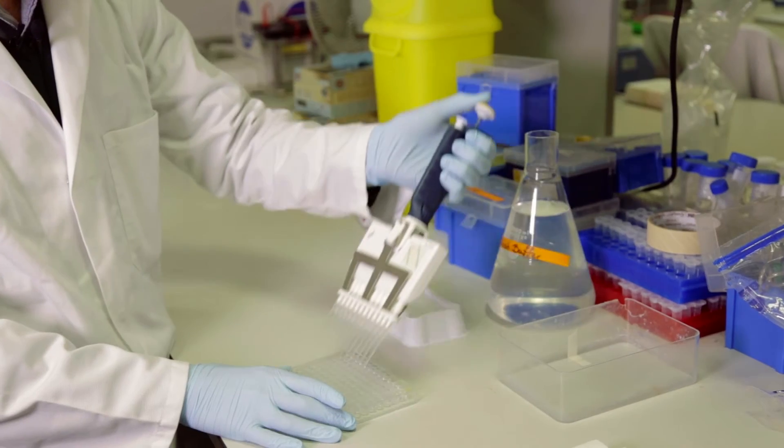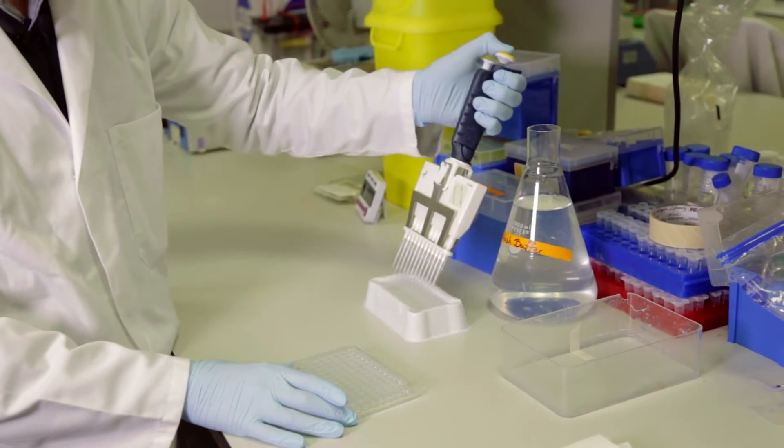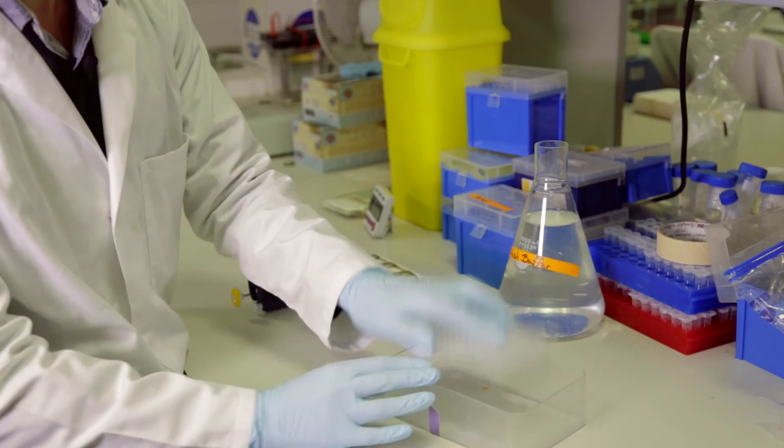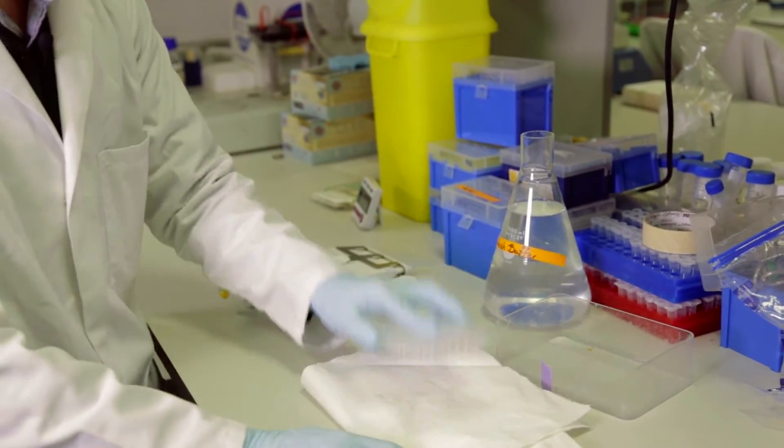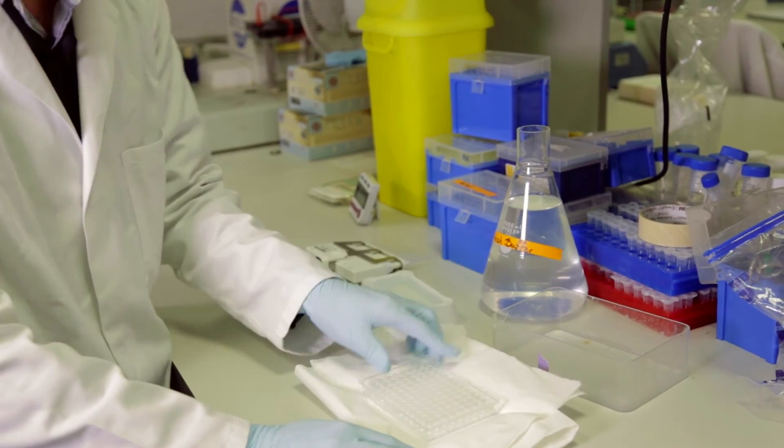The following day, the plate wells are washed three times in a wash solution consisting of PBS and a mild detergent. It is very important to ensure that the plate is thoroughly dried and all detergent has been removed from the plate, as any remaining detergent will affect the overall procedure.